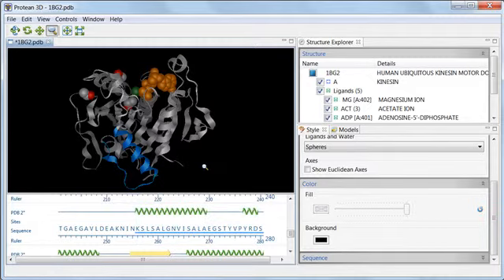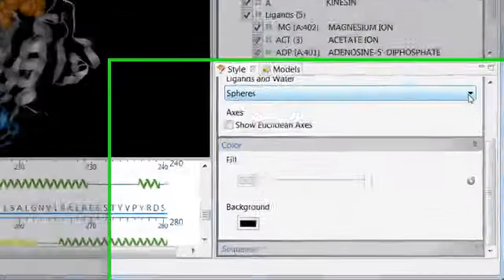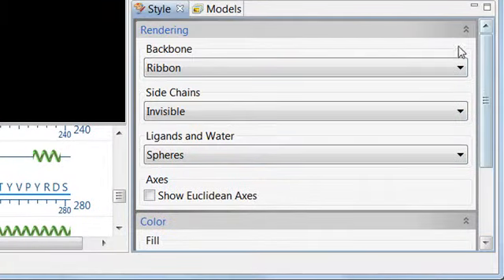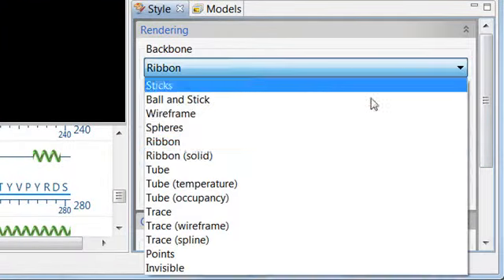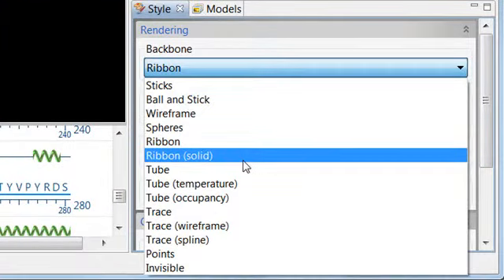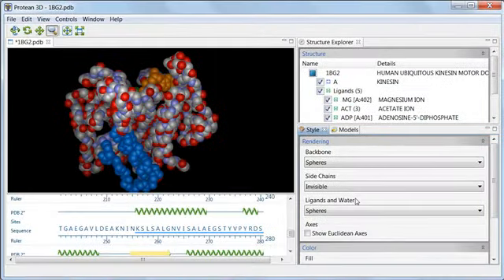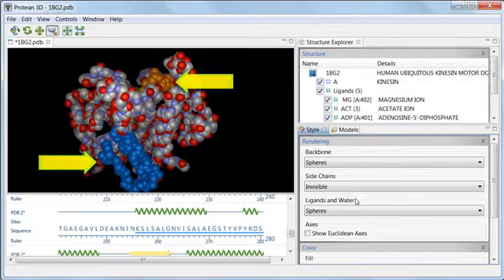Finally, let's see what our changes look like using another rendering style. I'll change the backbone style to spheres this time. As you can see, this gives the structure a completely different look, while preserving our earlier color changes.